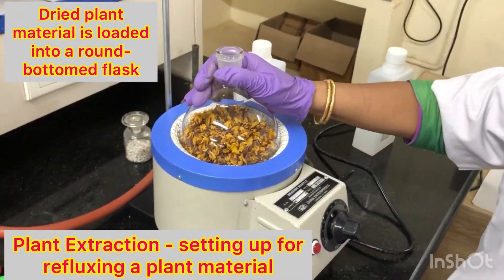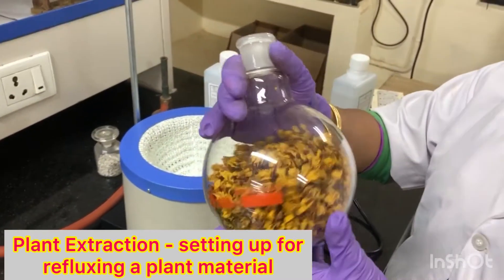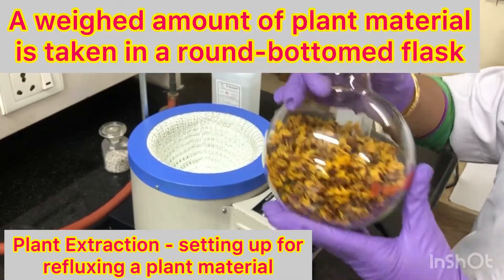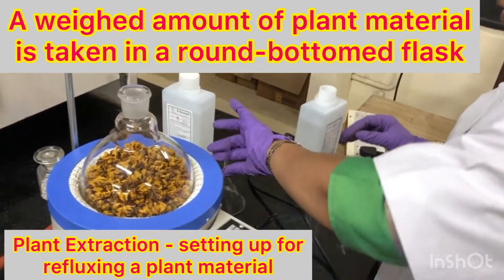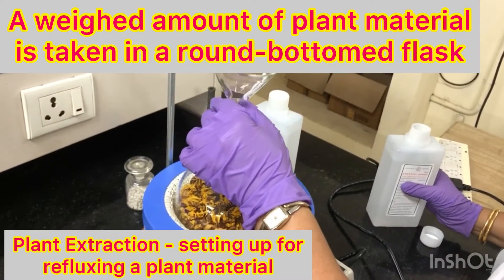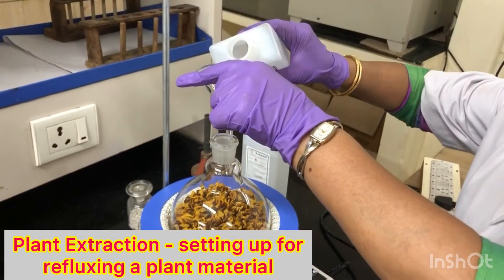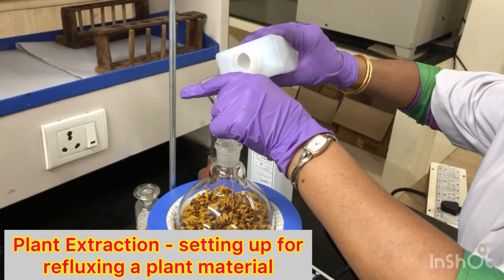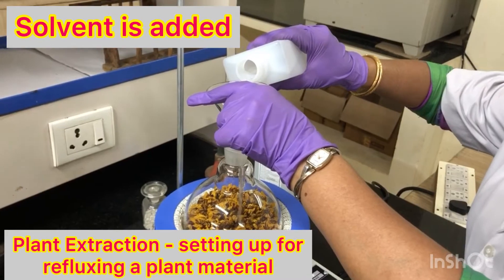We will see how to set up for refluxing a plant material. I have taken a weighed amount of plant material inside this round bottom flask, and then we will add the solvent using a funnel like this without spilling it inside the mantle. Sometimes if you are not very confident, you can keep it out on a stand.